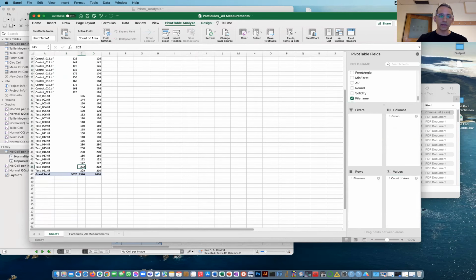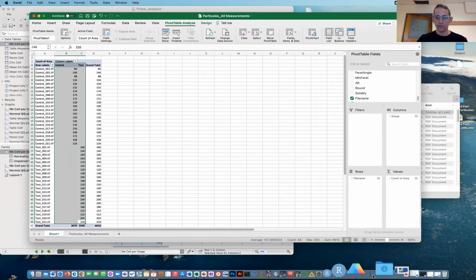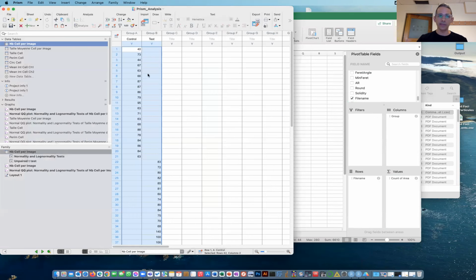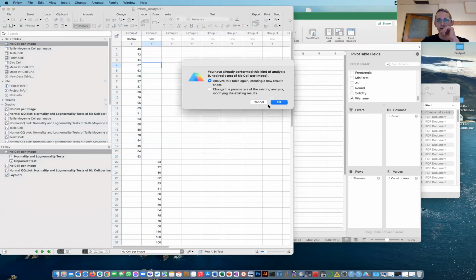And what I can do is statistics on that. So I copy this and go into my favorite software, Prism, and I plot this data side by side. Using this, you can do very easy statistics with the Analyze button. So if you do Analyze, you say, OK, I want to do a t-test comparing the two. I'm going to click OK.